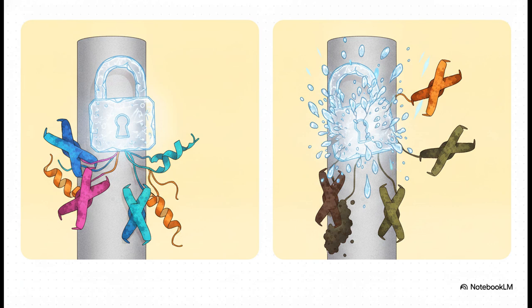So to really contrast these two states, that high salt concentration boosts the target-ligand interactions, effectively locking your protein right onto the column. Then, by slowly reducing that ionic strength, literally just washing the salt away, we weaken that grip. As water becomes available again to shield those hydrophobic patches, the molecules finally elute. And the cool part is, they elute strictly based on their specific degree of surface hydrophobicity. So your least hydrophobic proteins wash off first. Meanwhile, the highly hydrophobic ones hold on for dear life until that salt concentration drops to nearly zero.